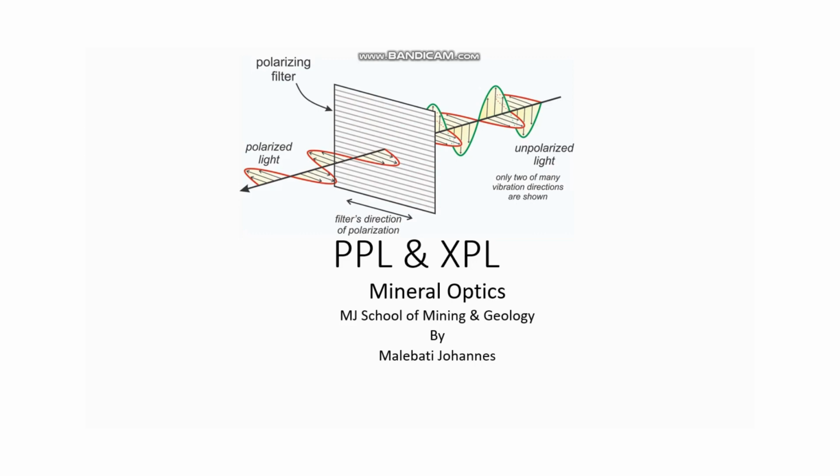In today's lesson, we're going to be dealing with plane polarized light and cross polarized light in mineral optics.